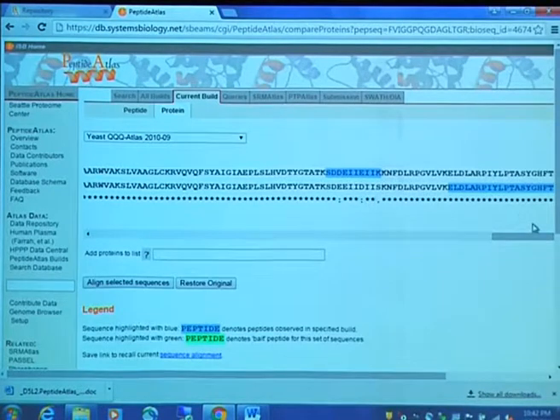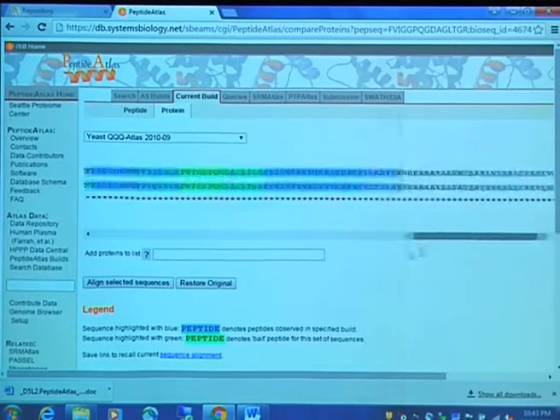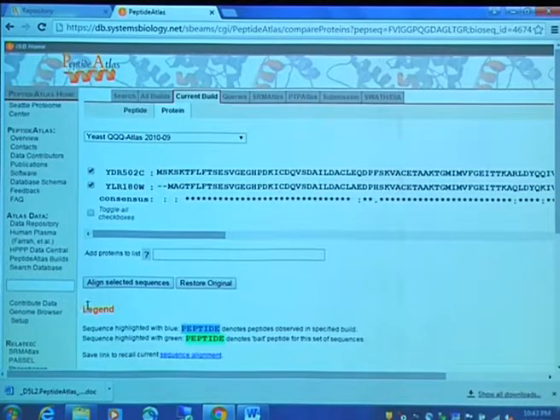As you scroll further out, again, these are very highly conserved proteins, where almost always you see an identical amino acid. The colon is more highly conserved, the dot is moderately conserved, and the space is not conserved at all. But these are very similar proteins. So it turns out that for these two proteins, there are two peptides that distinguish each subset. So these probably would have been distinguishable. They would be in separate protein groups, I would hope, in ProteinProphet.